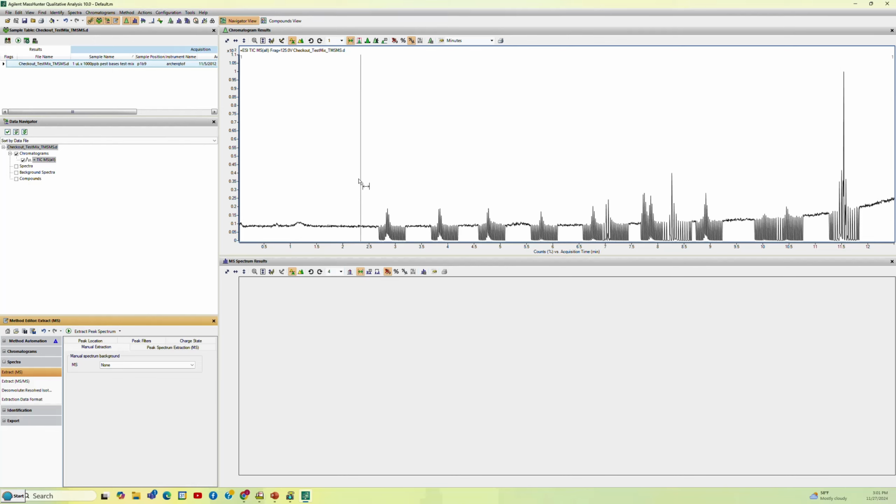And so what you're seeing here is it's going along, but then when it goes into the targeted, it jumps between the different parts of the experiment that were assigned by the operator running the sample. It's doing MS data acquisition, and then it'll do three different collision voltages, 10, 20, and 40. So this is why it's so ragged. It's jumping between all of those different experiments.